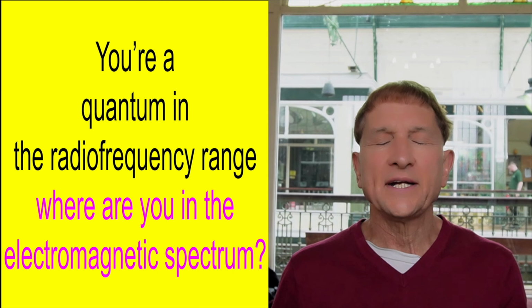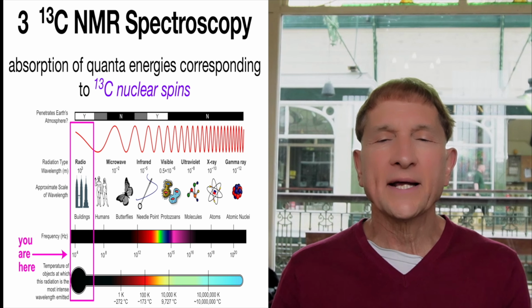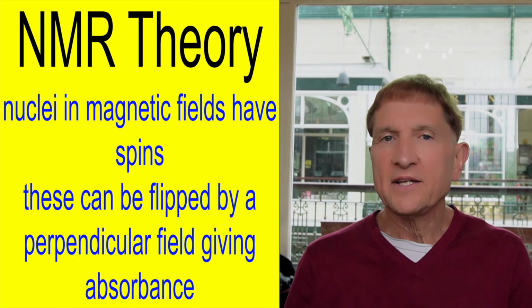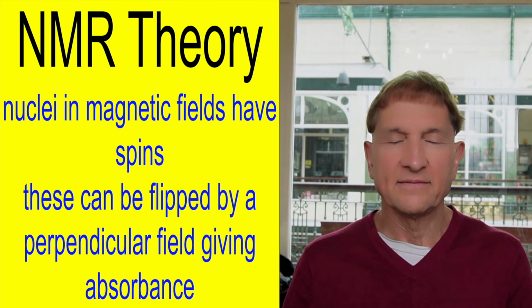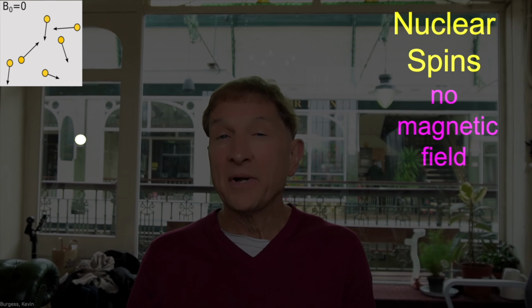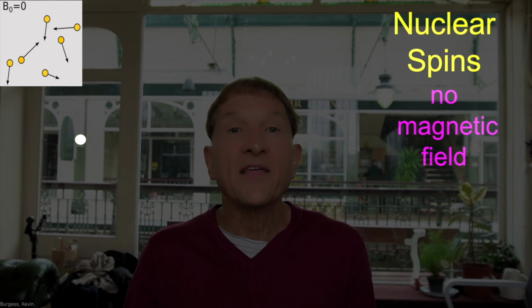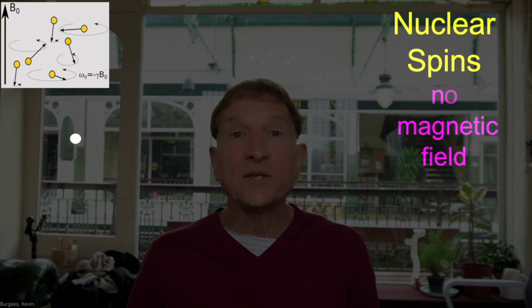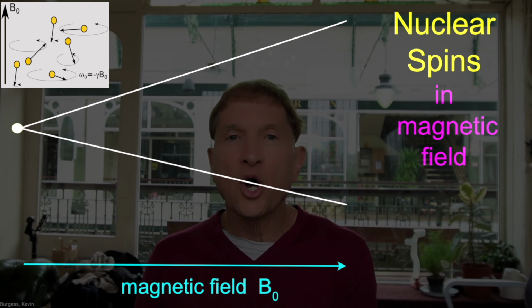NMR machines operate at the low energy, long wavelength end of the electromagnetic spectrum. If you don't know already, you may be surprised that some nuclei have a nuclear spin. Spins of 13C and 1H can be plus a half or minus a half. But if there's no magnetic field, there's no difference between these. They have the same energy. However, in the presence of a magnetic field, let's call it B0, these spins either align or oppose.